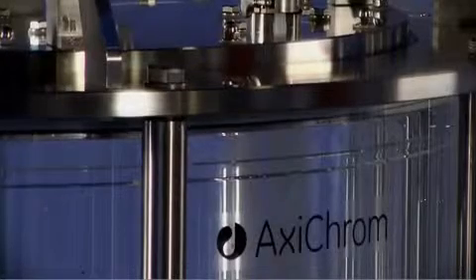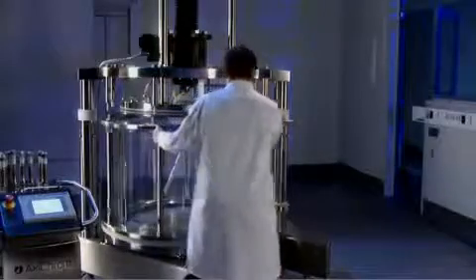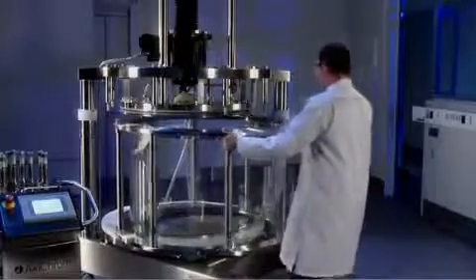The column tube is raised from the bottom. The adapter is raised above the column tube. The column tube can then be swung out completely.